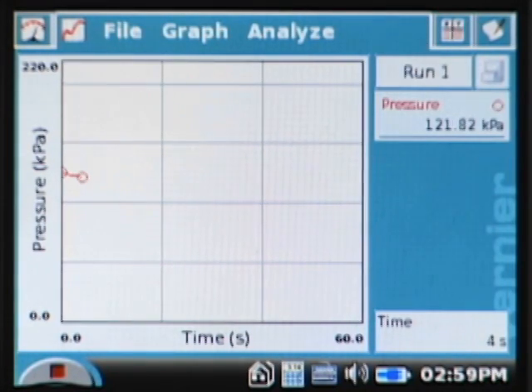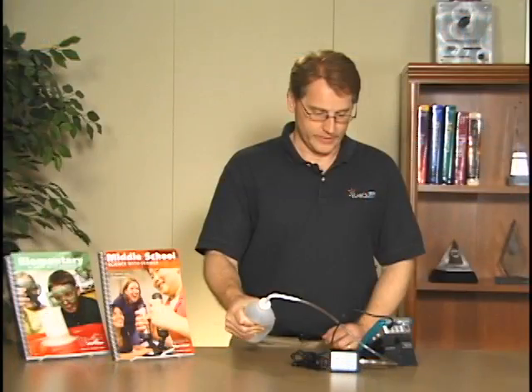I start squeezing—I press collect—and I will continue to squeeze for 60 seconds. As we do this, you'll see that it is drawing the graph real time. It's recording data once per second, and it's going to do that for those 60 seconds, and you're squeezing and squeezing. You may notice that the pressure that's listed there begins to decrease a little bit as my muscles fatigue, then my ability to squeeze the bottle begins to decrease.